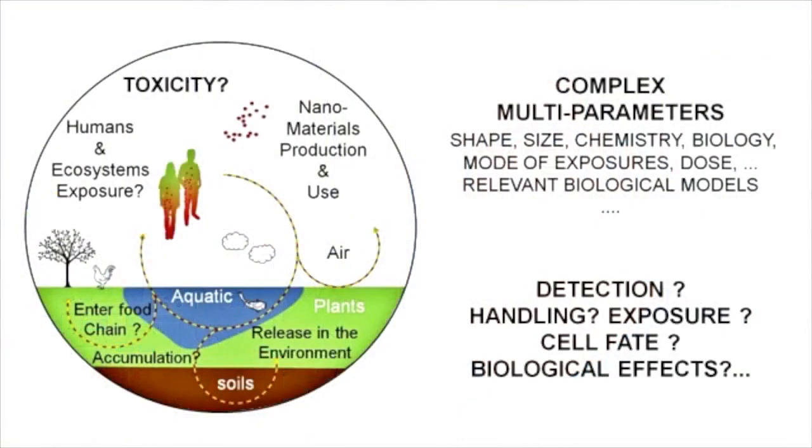to nanoparticles. This is partially due to the lack of methods that allow the detection and quantification of internalized nanoparticles in a single cell. While numerous analytical tools, including microscopy and mass spectrometry, can be used to estimate the cellular uptake of nanoparticles, these only provide qualitative information at a macroscopic level.